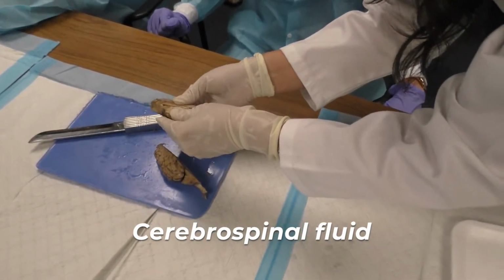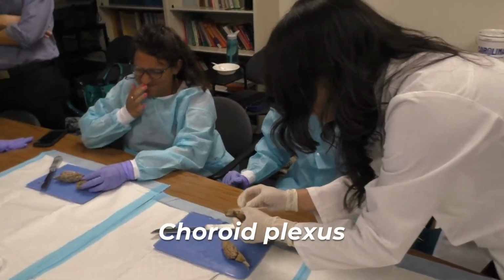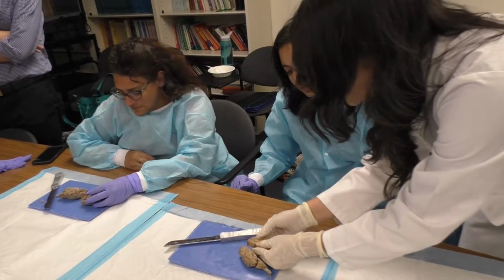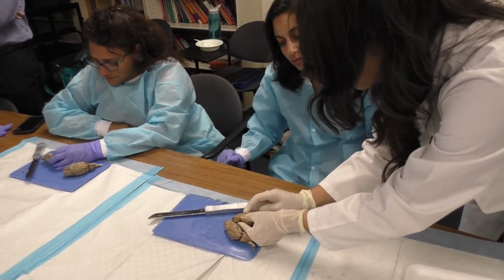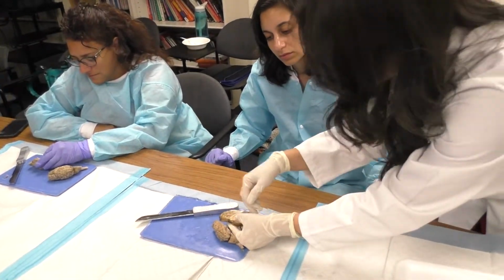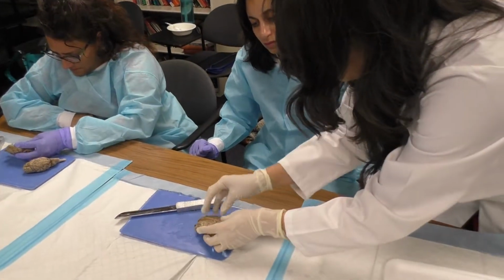In fact, the choroid plexus, which is the structure, and this is probably choroid plexus, black and kind of gooey looking, creates the CSF. So it's being created and synthesized in the lateral ventricles, and it goes from the lateral to the third to the fourth, and out into the outer covering of the brain.